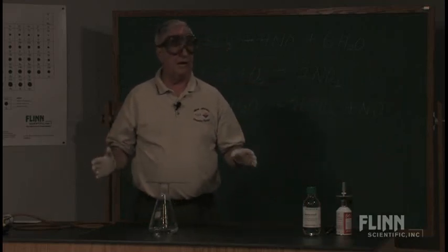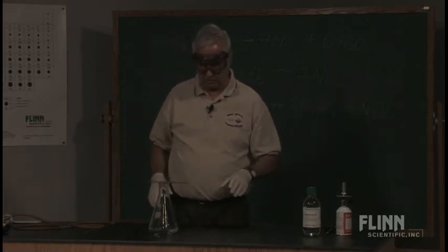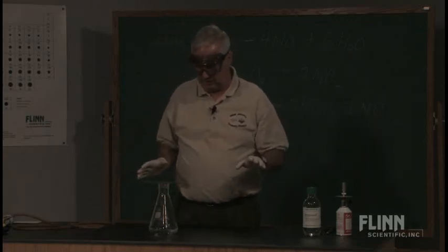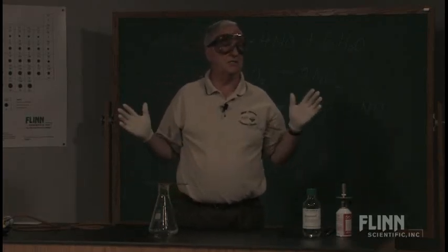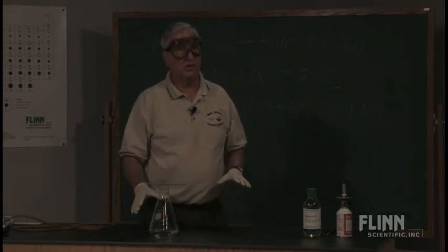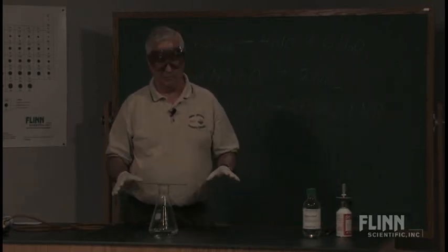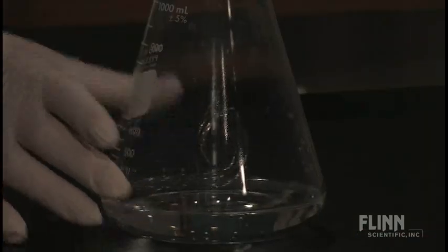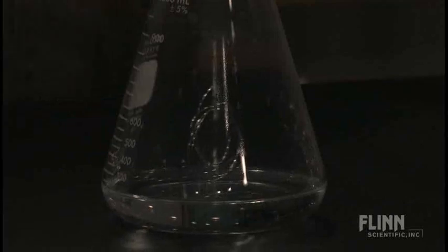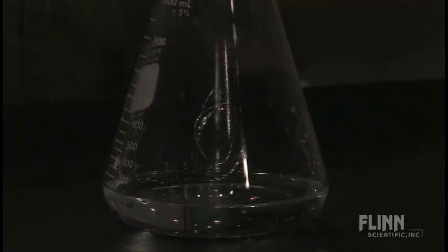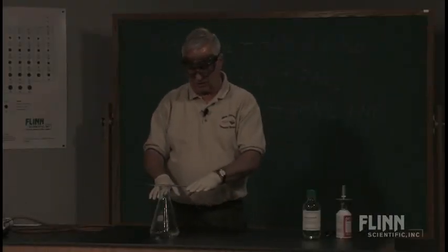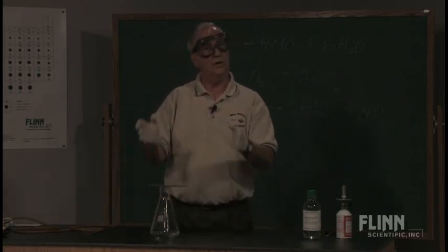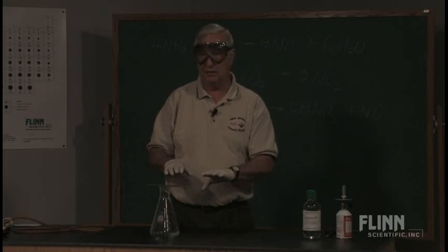Frequently that happens, and in an air-conditioned room, the catalyst will cool off. Now, if you are going to do a demonstration, this is possibly as simple as you could do it, by showing the catalytic action of the platinum. What's happening is on the surface of the platinum wire, we actually have the oxidation taking place. The problem with this demonstration doing it this way is there's a very limited air supply. There's very little oxygen in the flask.